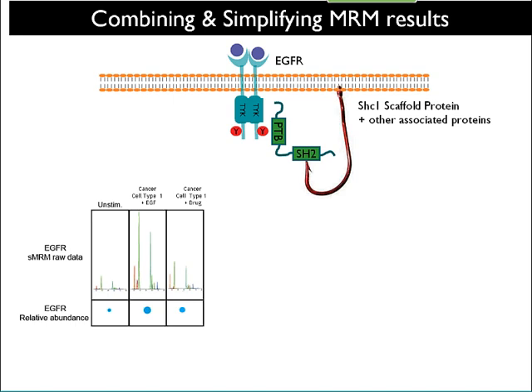So this is what traditional MRM of peptides looks like. Every one of those signals is actually a summation of three, what are called transitions. So there's multiple data being piled up here for evidence. This isn't one measurement. It's more like 8 or 9 or 10 or 11 peptides times three transitions. So 33 or 40 measurements just for that one protein.